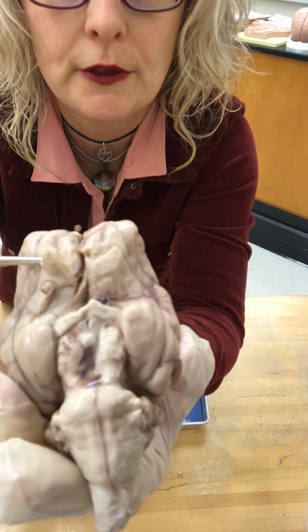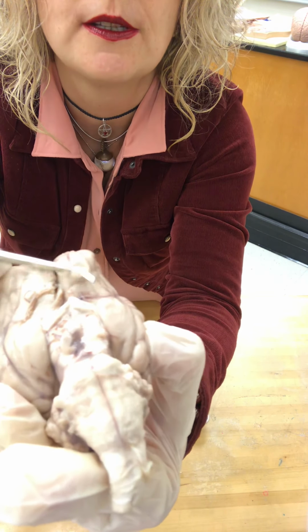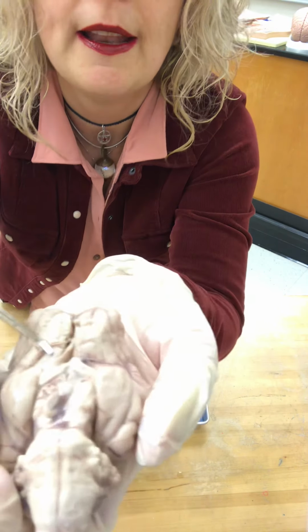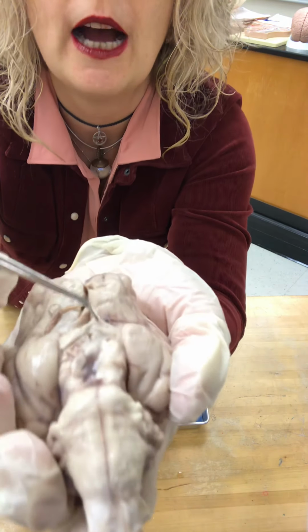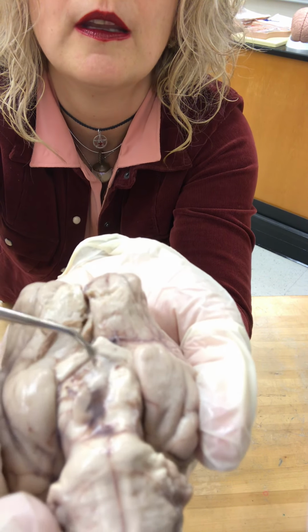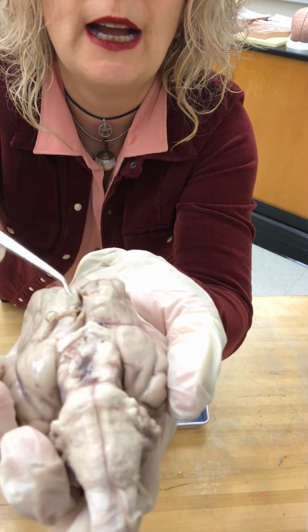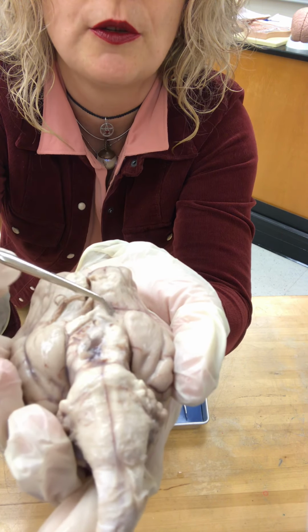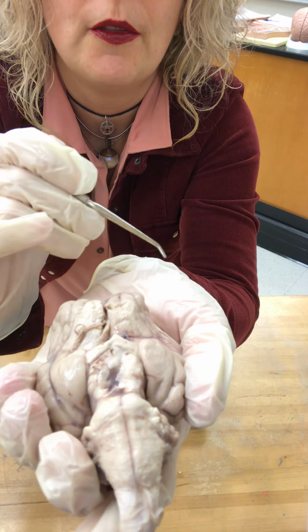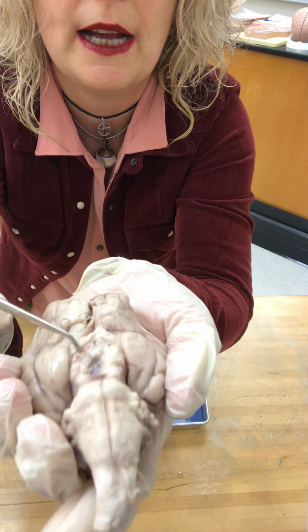This is the olfactory bulb, as you can see right there. Olfactory bulb on both sides. Lifting it up, there it is. Olfactory bulb. All right, next take a look at the optic chiasm right here. Okay, optic chiasm. So the optic nerve, if it's coming from the left eyeball, it's going to crisscross to the right fibers of the optic chiasm. And then the right eye to the left, crisscrossing at the optic chiasm.